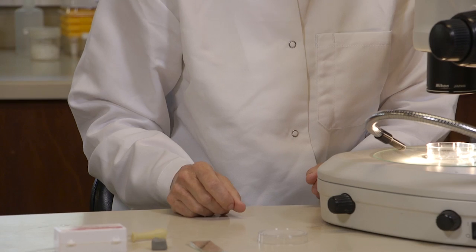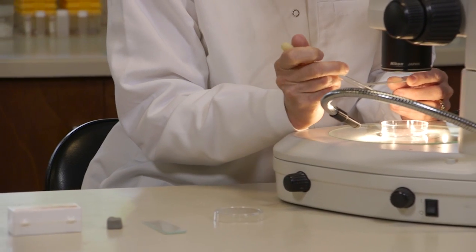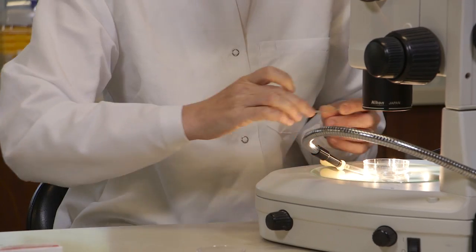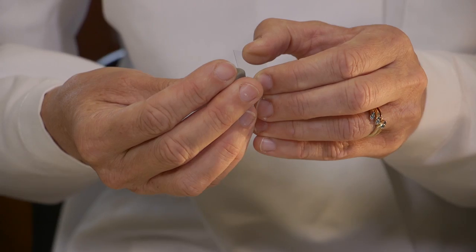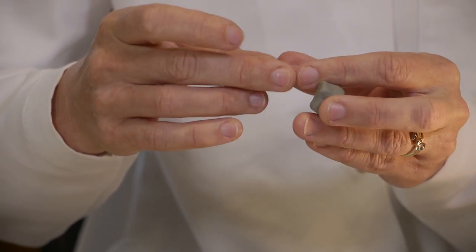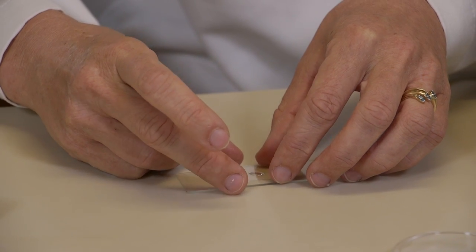So you will need to make a slide prep and examine each larva under the compound microscope. Use a glass slide and pipette the larva onto the slide in a small drop of seawater. Then take a cover slip and use a piece of modeling clay to create little feet to support the cover slip over the slide so you don't squish your specimen, and gently lower the cover slip onto the slide.